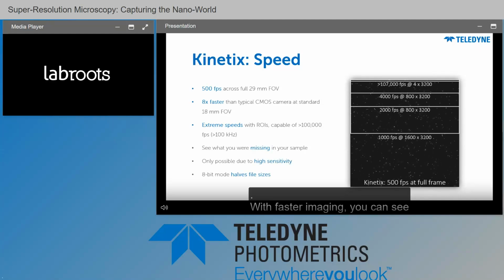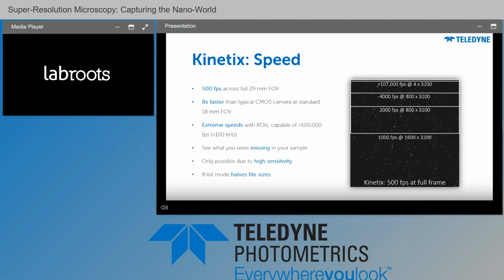With faster imaging, you can see what you are missing in your sample. This is only possible due to high sensitivity. If you want to image at 1,000 frames a second, your exposure time needs to be 1 millisecond. So you need to be able to collect all the data you need in 1 millisecond in order to image this fast. So the camera can only be fast because it is sensitive.